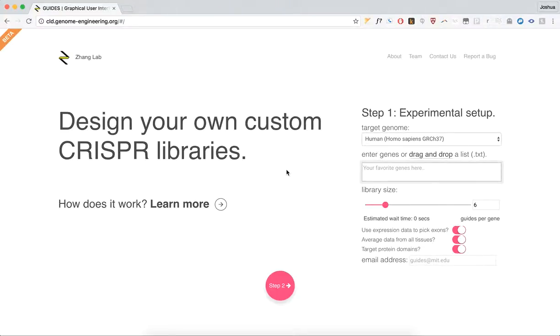Hi, welcome to Guides, where you can design your own custom CRISPR libraries. Let's get started.